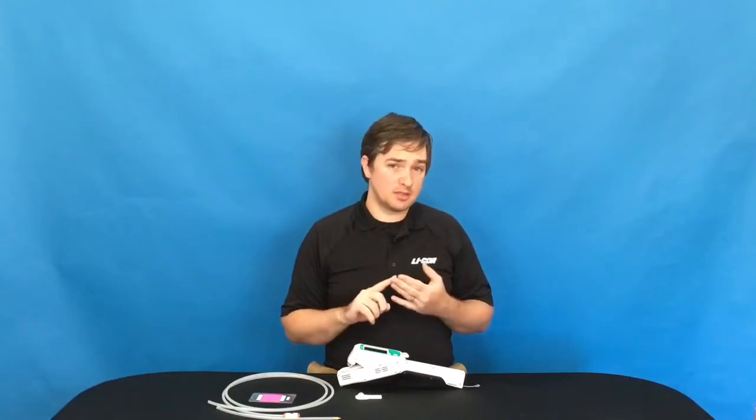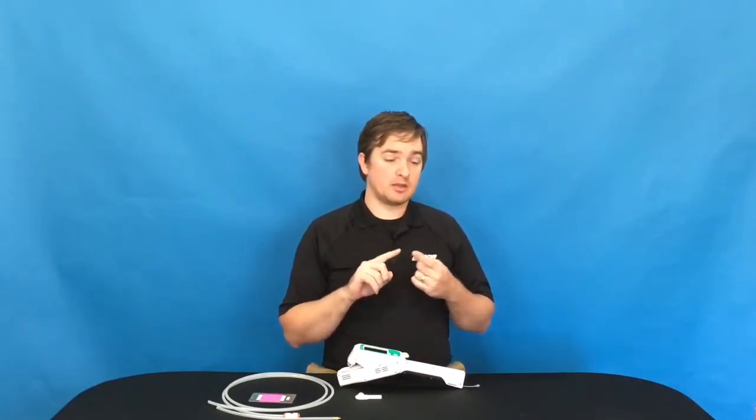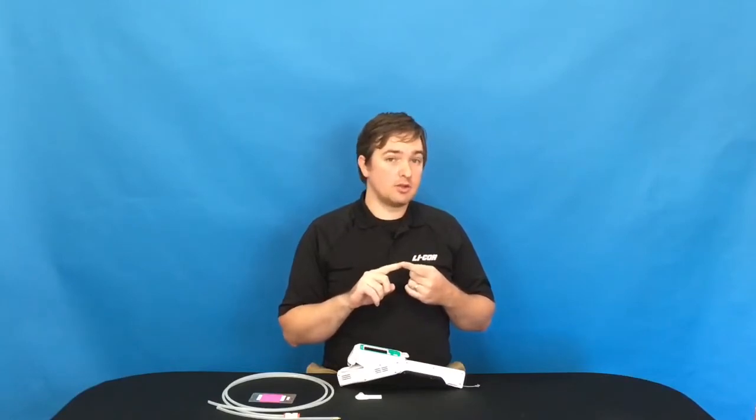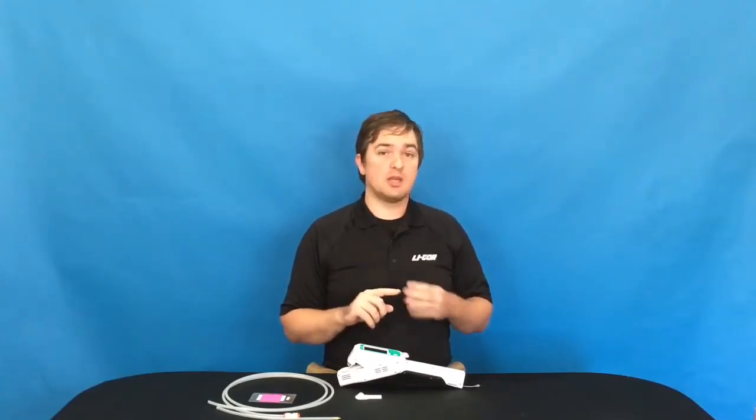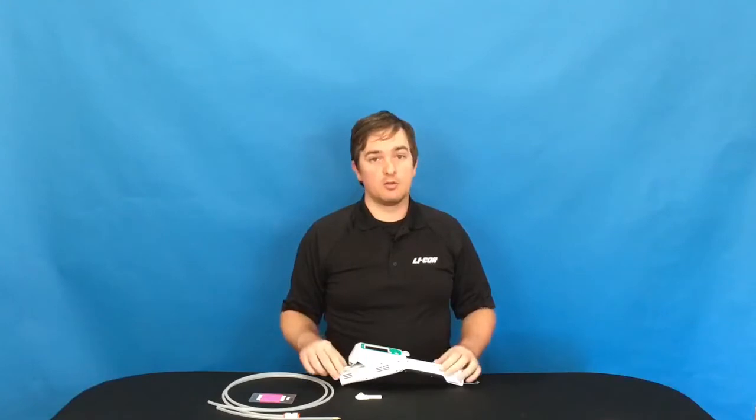There are 3 methods to do this. One would be an external pump with desiccant, and I'll show you how to use that in this video. Another method would be to use a tank of dry air. I'll also show you that. A third method would be to use the internal pump in the LI-600 to flow desiccant air through the relative humidity sensors. That process is described in another video.